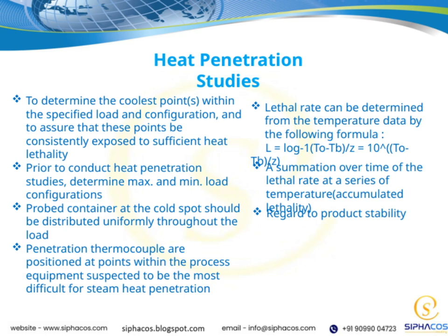When placing probes, especially for temperature measurements, we need to be strategic. The container at the cold spot should be uniformly distributed throughout the load. This ensures we get an accurate picture of temperature variations across the entire load. Finally, we position penetration thermocouples at points within the equipment that are suspected to be the most challenging for steam heat to penetrate.